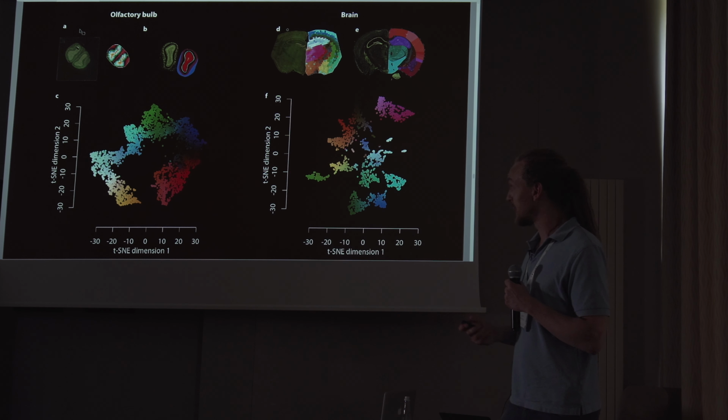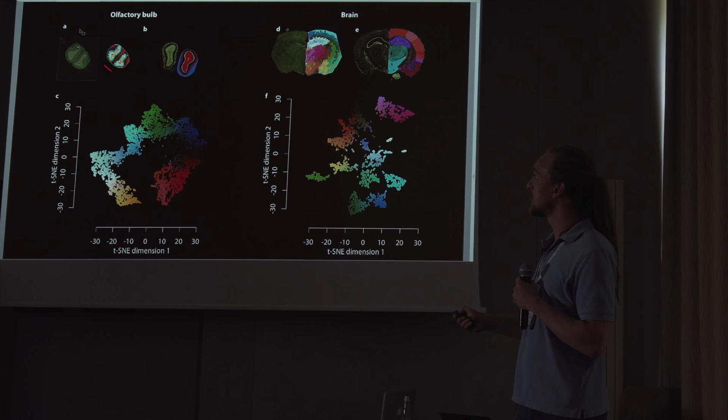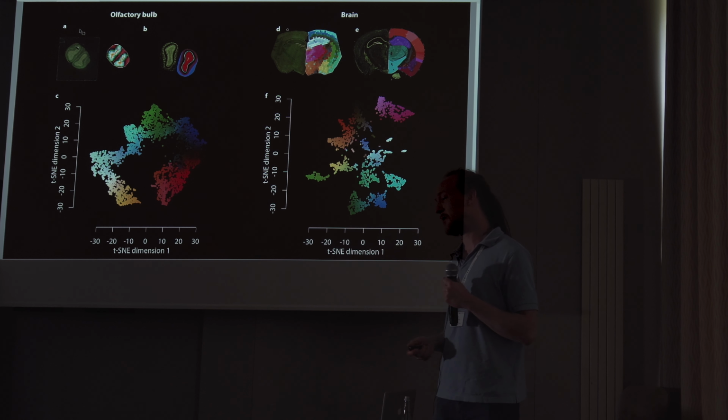So my guess is that in this case our spatial sampling is not dense enough to get points in the transition so much here as we get it over here. But the more important message of this slide is that if you contrast these automatic results with what you have in a reference anatomy atlas, there is an extremely strong concordance. I mean, just imagine performing one experiment and getting the same result that people had been accumulating over years.